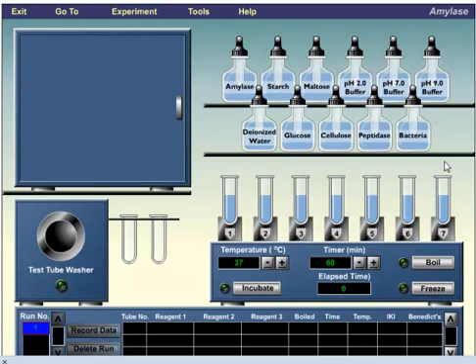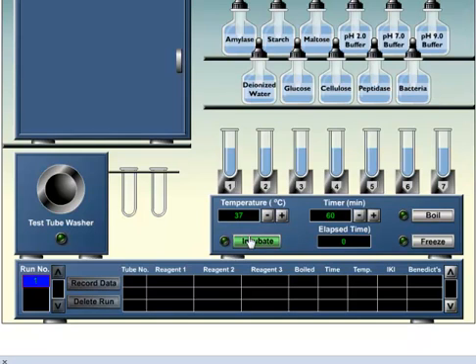So now what do we do? Once you add these, you incubate it.